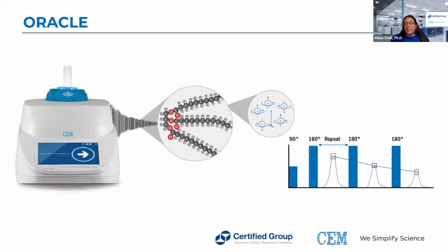Okay, so again, this is CPMG TD-NMR at the end of the day, right? And so that's what's going to allow us to get that direct measurement. What that's using is a specific pulse frequency that you see pictured here, the 90 degrees followed by the echo of 180 degrees that goes one after another in a train of those echoes. And with that specific radio frequency, we can hone in on the lipid molecules. So how do we do that, right?